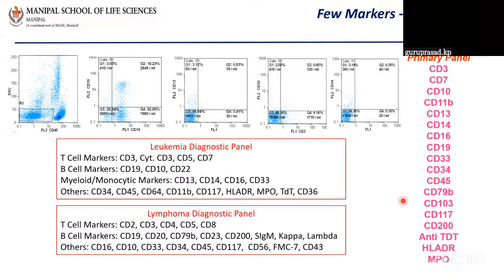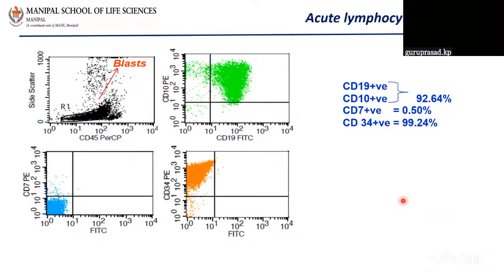Generally, people use it for acute leukemia panels. They use leukemia diagnostic markers such as T lymphocyte markers, B lymphocyte markers, neutrophil, basophil, and eosinophil markers, or natural killer markers. They have a panel of markers, and based on the positive and negative results, they identify the cancer type.